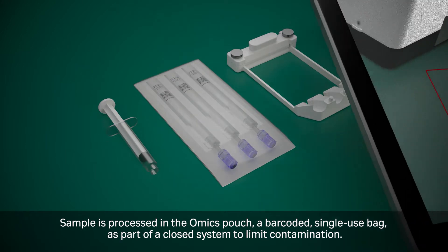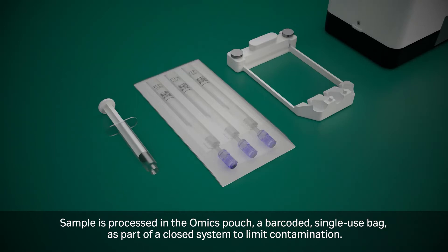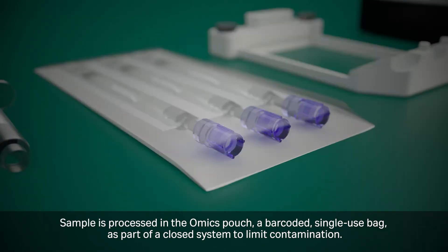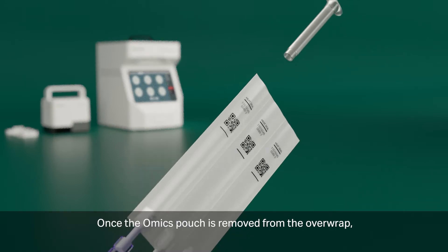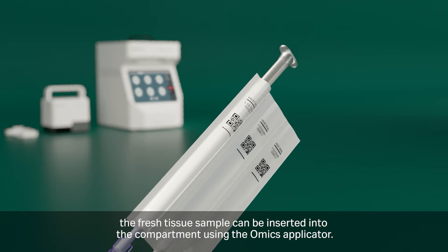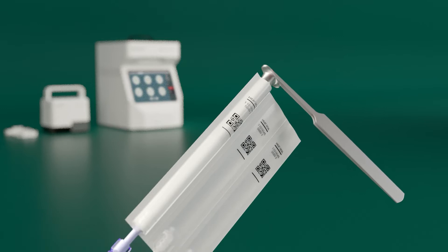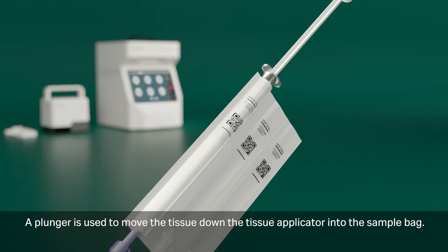Sample is processed in the Omics pouch, a barcoded single-use bag, as part of a closed system to limit contamination. Once the Omics pouch is removed from the overwrap, the fresh tissue sample can be inserted into the compartment using the Omics applicator. A plunger is used to move the tissue down the tissue applicator into the sample bag.